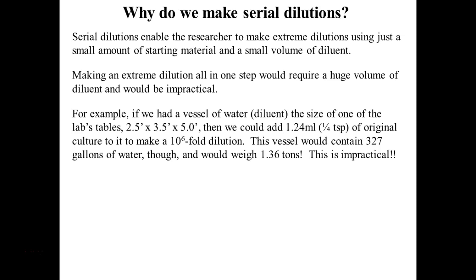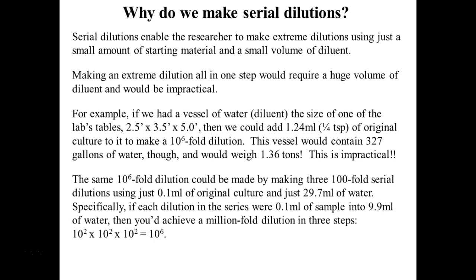If you were to take, say, one of our lab benches, right, and do a set volume of water there, we're talking about 327 gallons it would take to fill up one of these lab benches, the volume that one of these lab benches makes up, right? That would be 1.36 tons. Wow. That's a lot, right? Really just not practical. So if we do it in series, though, we can very easily reach very high dilution rates with much smaller volumes, as you observed today.